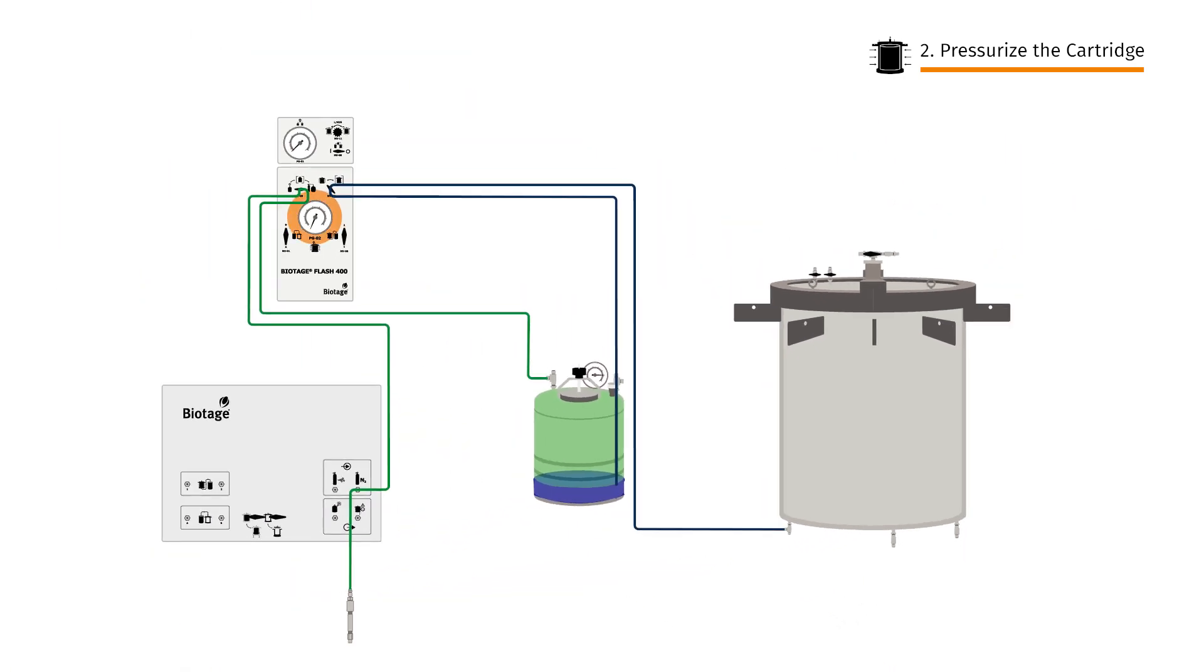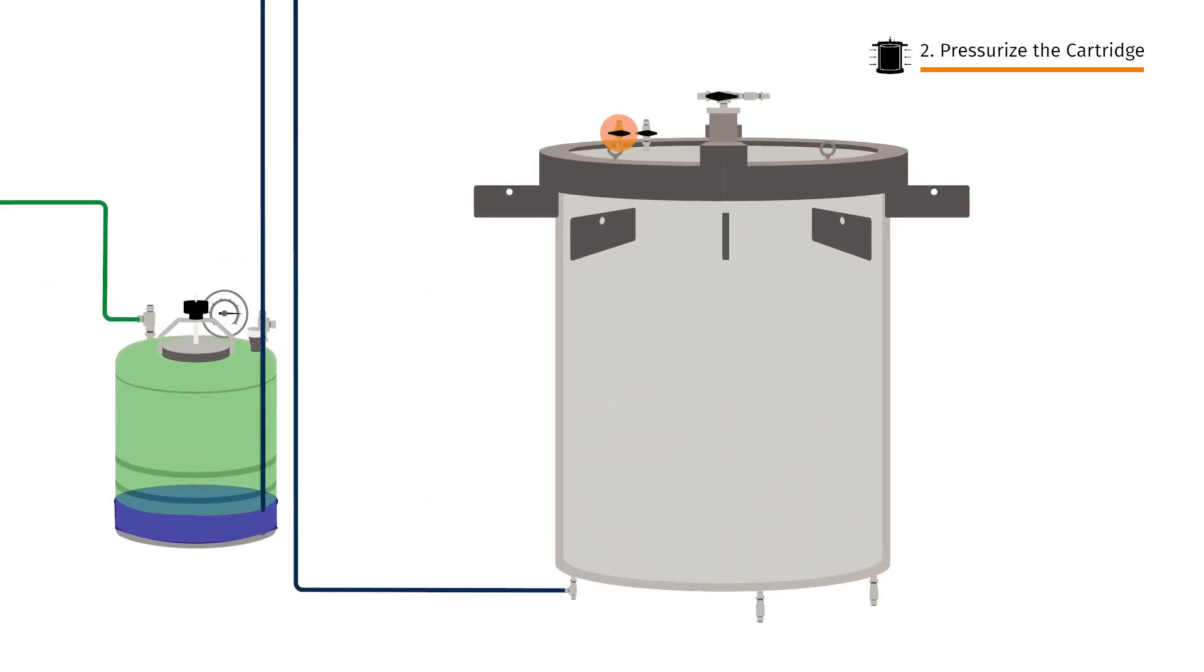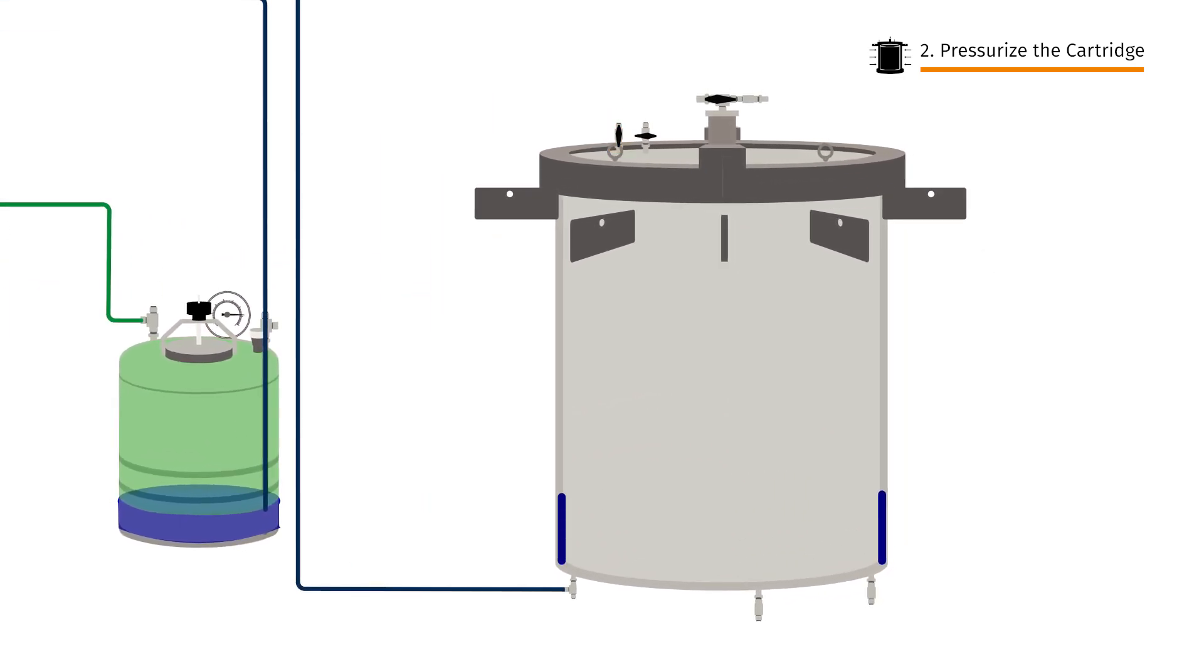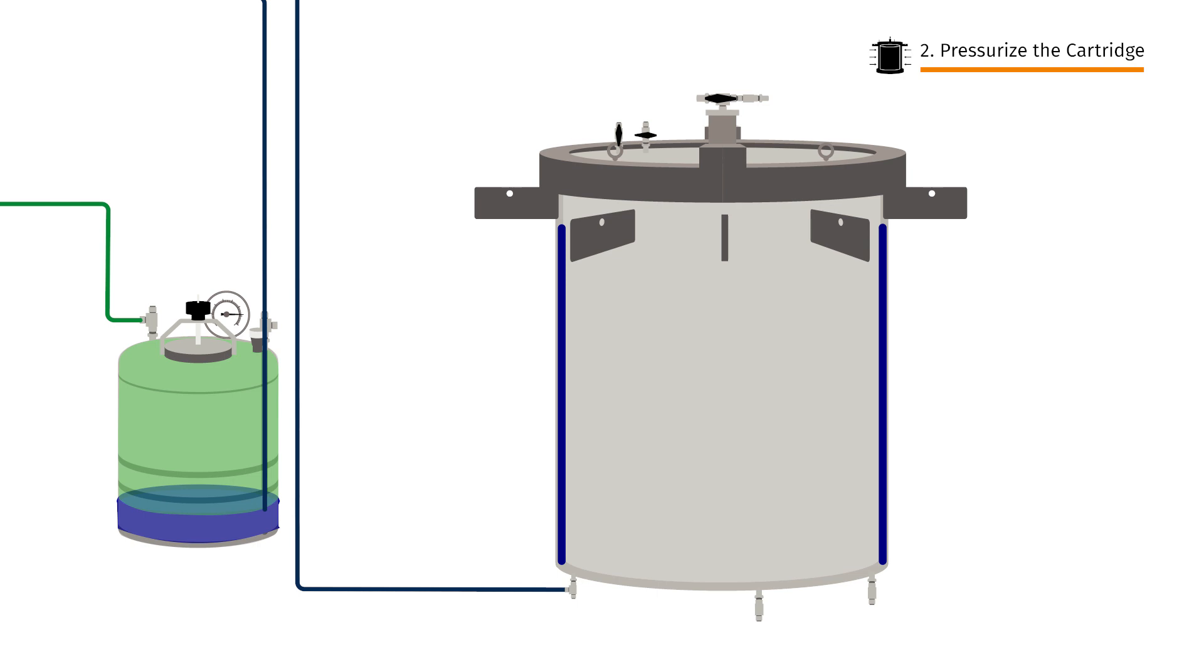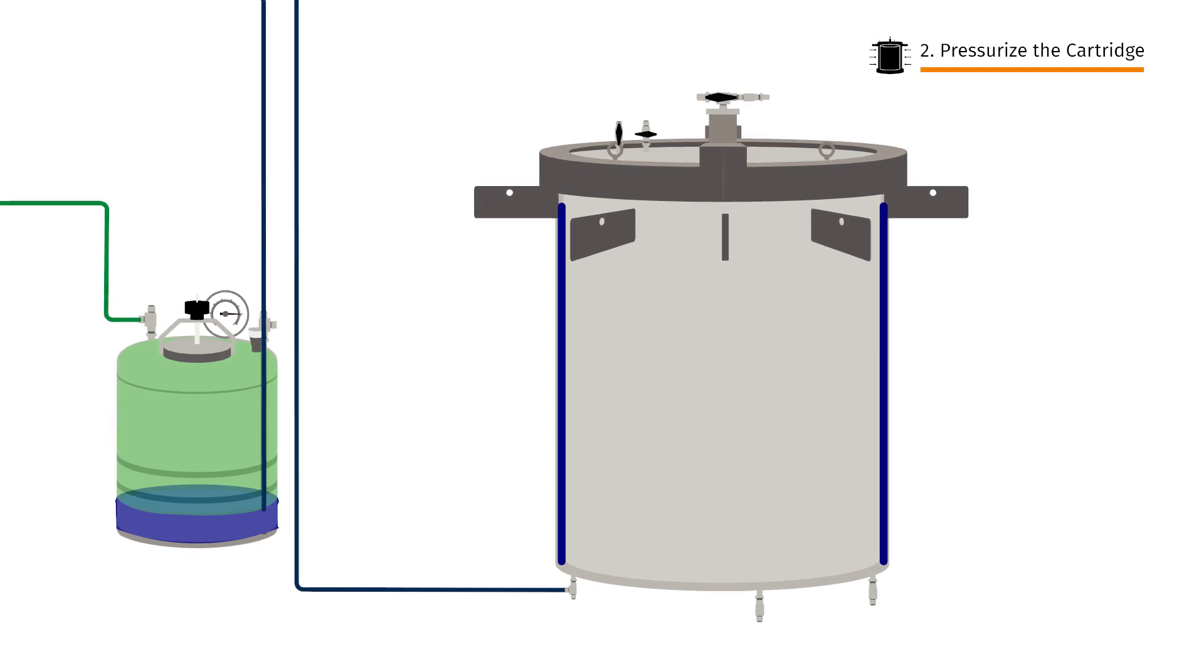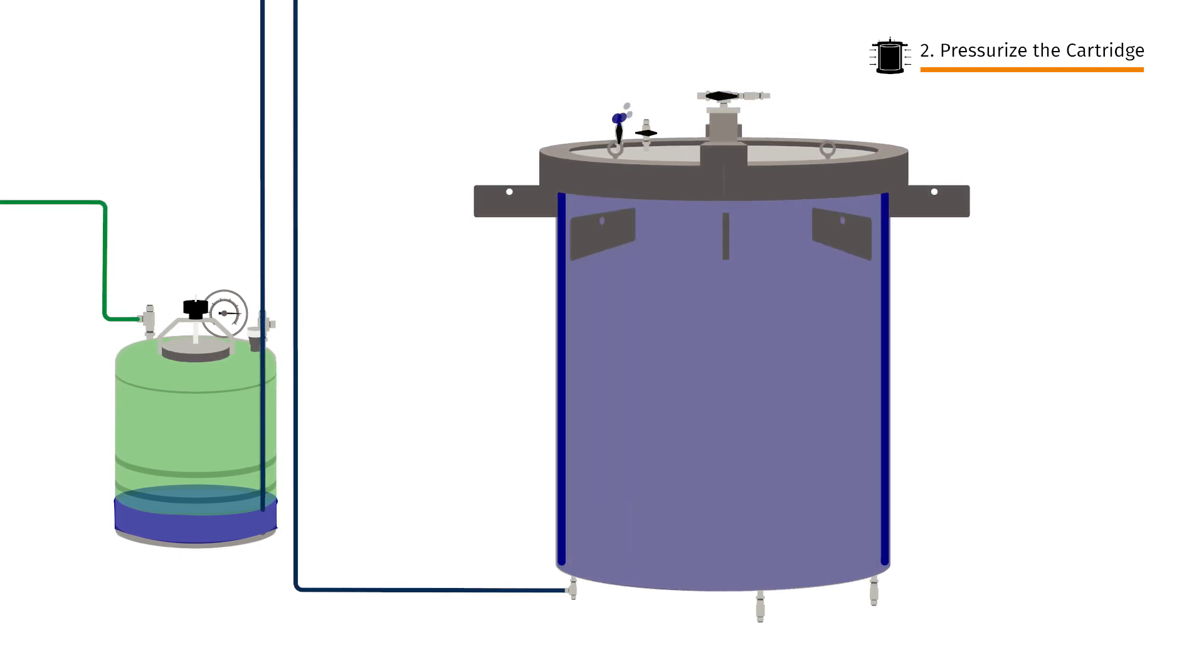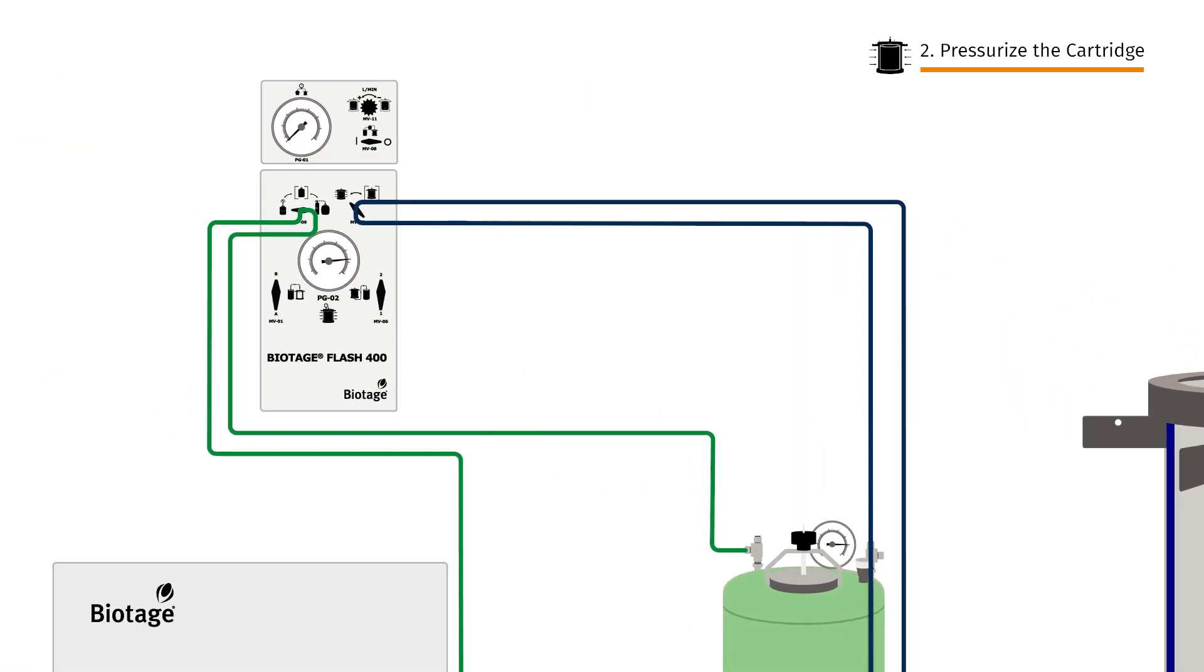When the control panel gauge matches the reservoir, open the vent valve at the compression module head. The compression fluid rises in the space between the cartridge and the compression chamber steel wall, completely surrounding the cartridge in a blanket of fluid. When done, close the vent valve and isolate the compression module again.